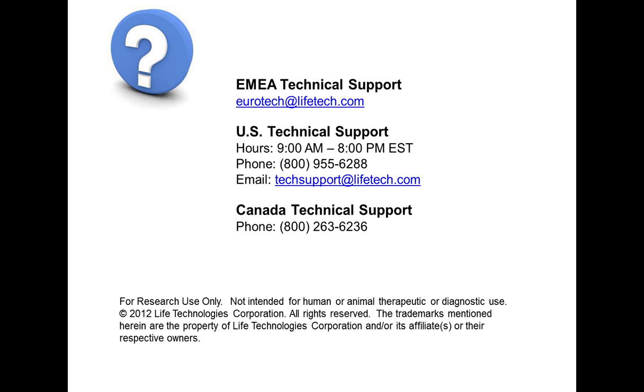The voltage that you select will also have an effect on your compensation. So I invite you to come back to our next webinar and we can discuss that further.